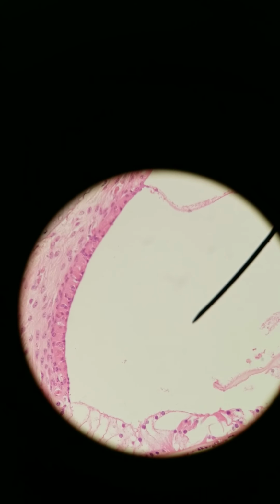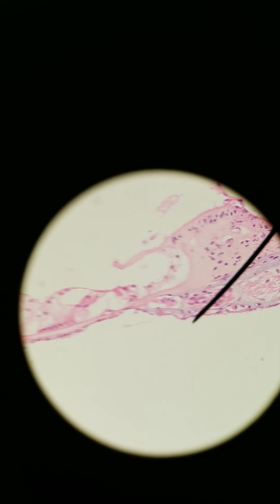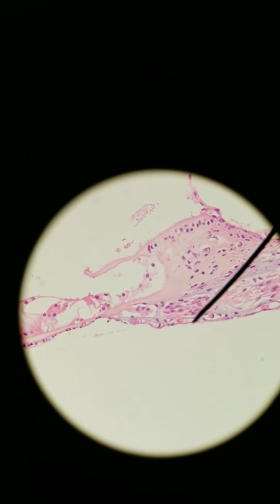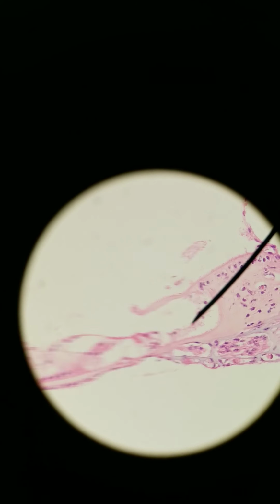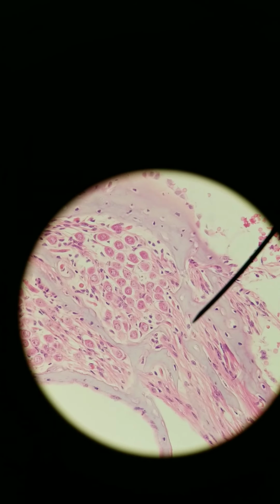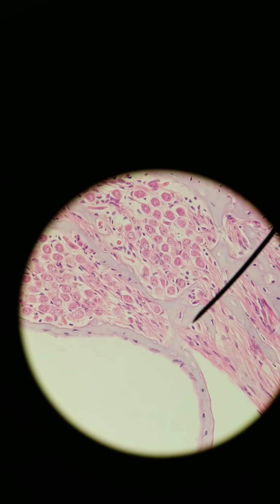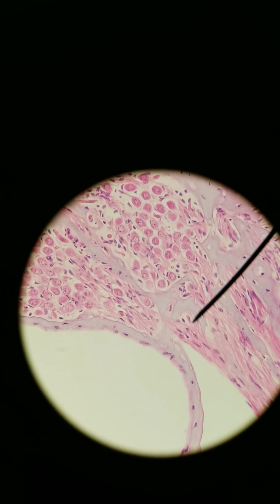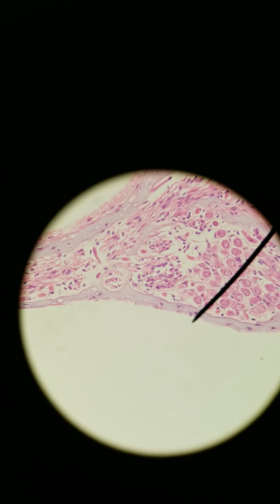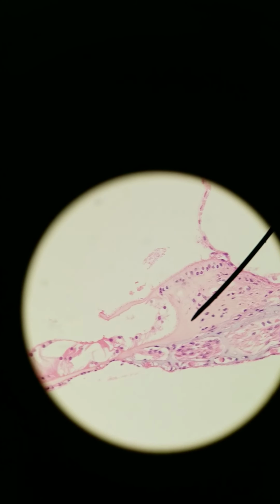We're in scala media here. This is scala media. Here are the hair cells. Here's the basilar membrane. But these hair cells communicate with a sensory neuron that extends out. Here are their cell bodies, and the axons keep going. What you see here, this is bone. It's the temporal bone. The cochlea is protected by the temporal bone.